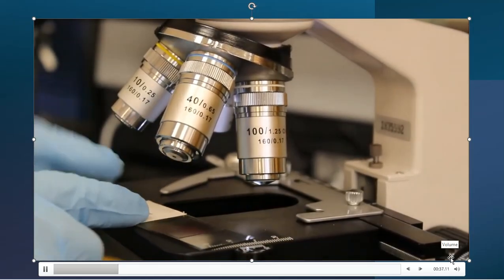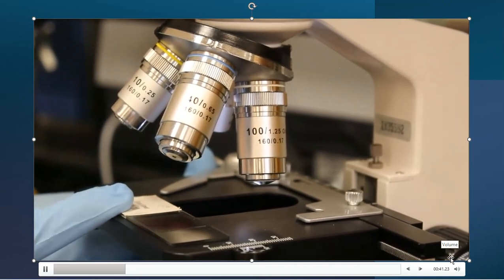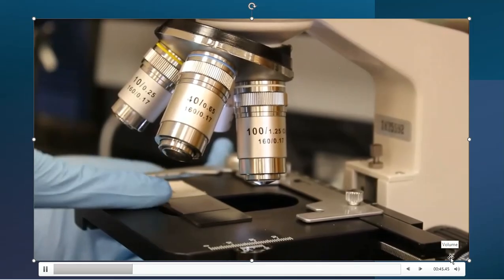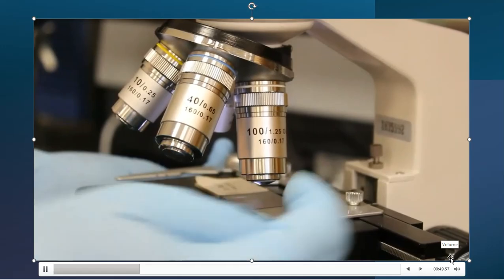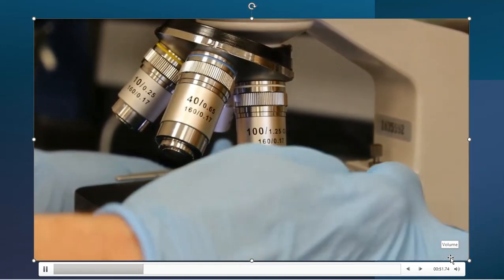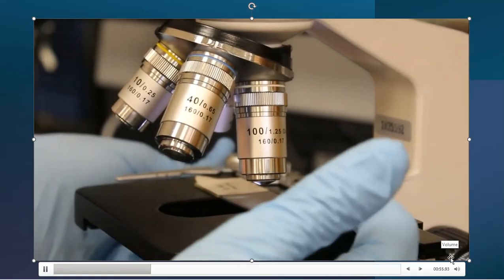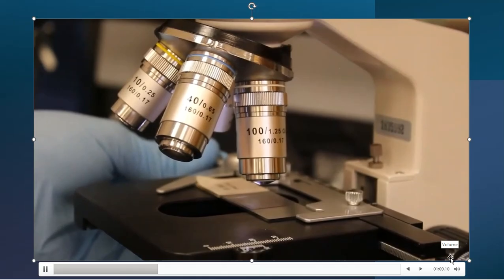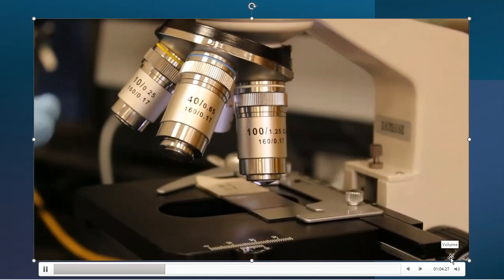So it's faced up. And then on the platform, I'm going to take this clip, and I'm going to push the lever back. Then I'm going to take the slide and slide it on the back side of that platform against this stainless steel piece on the corner. It fits into the corner at a 90-degree angle. It's very easy to snap into place. And that clip holds it there, so the slide does not move around.